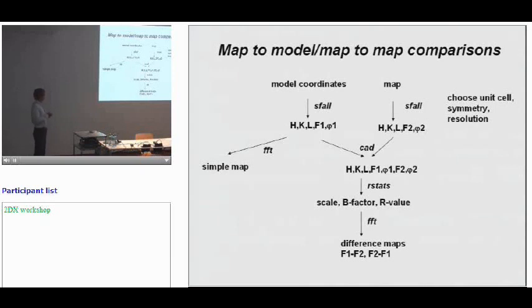But in this case, I wanted to take advantage of the fact that in many single particle cryo-EM projects, I think there are X-ray structures or maybe other cryo-EM maps which you can compare with. And if you have a reliable X-ray structure, you have a very reliable structure to compare with. So I was curious if this could be done using existing programs in the CCP4 package. So here, this is a map. It could also be, of course, a low-resolution electron crystallography map.